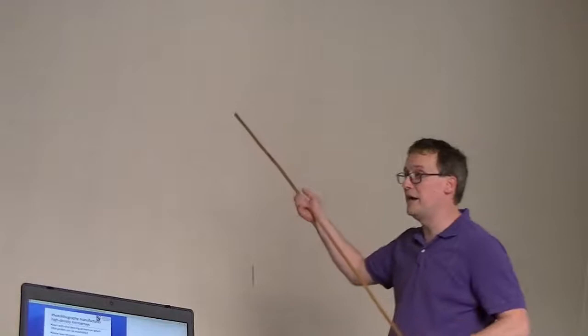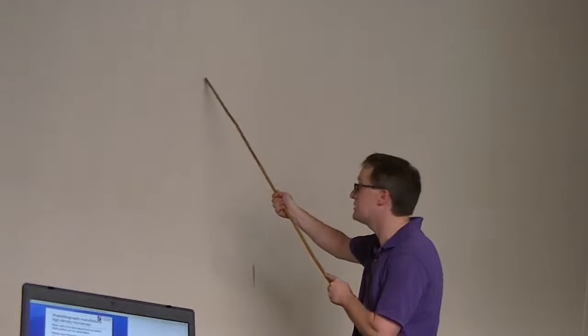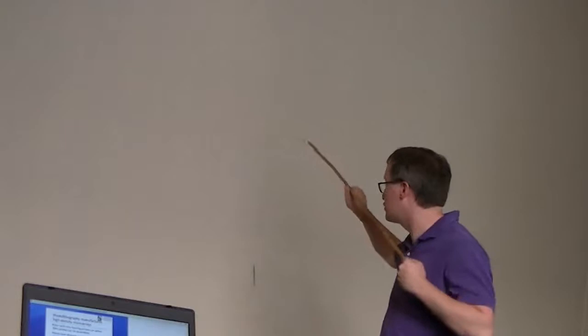So the first nucleotide that I'm going to add to this surface is going to be A, let's say. Now remember, I said that this first probe is going to start with A. The second probe is going to start with C. And this one is also going to start with A. So my laser shoots a hole in where the first probe is going to be and in the spot where the third probe is going to be. It does not shoot at the second probe. Right? So by photo etching, I've blown the mask off of spot one and spot three, but not spot two.